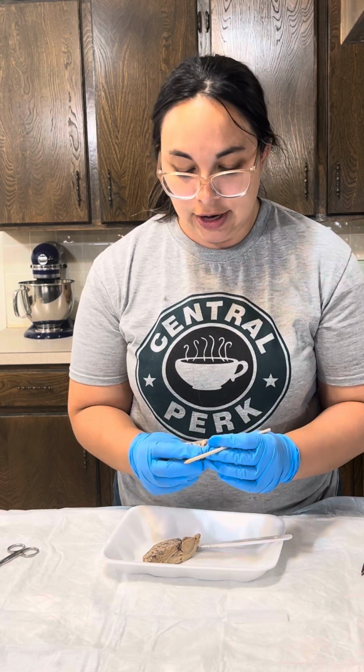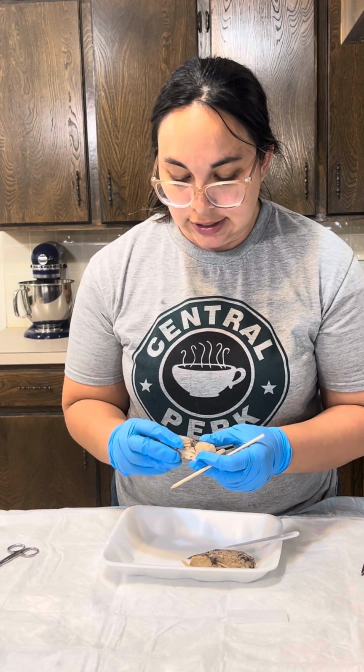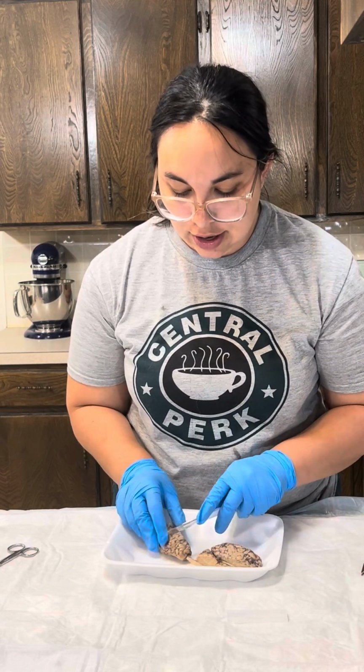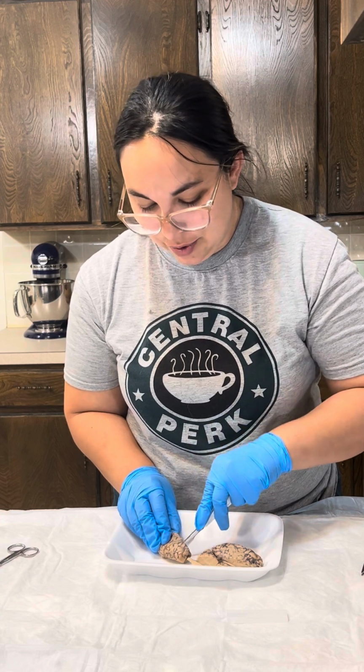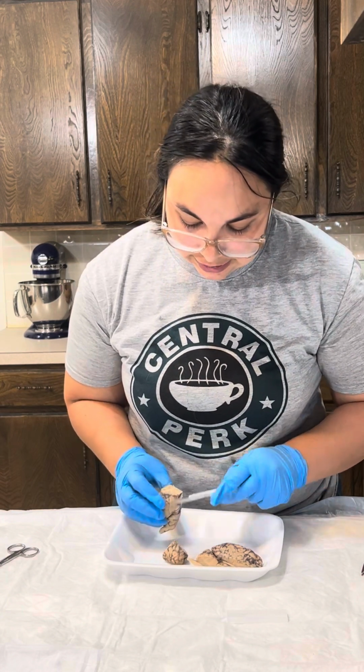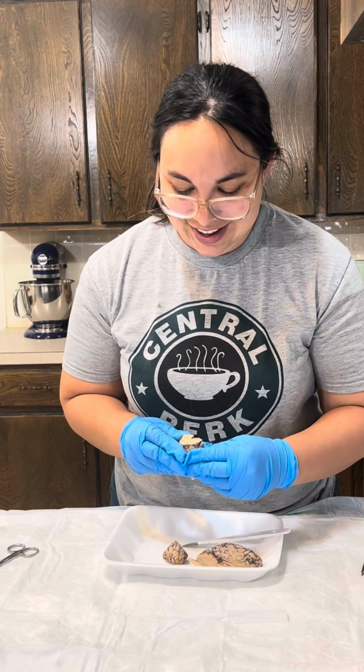So that's that part. There are parts here, if you notice, let's see, we're going to cut one of these open a little bit more. You're okay, it's good. All right, let me make sure I got everything that I need to talk about for that part. Okay, we're going to cut a piece. I'll tell you when I'm done. All right, so this is the next piece here. I'm done. Oh, I'm sorry. I'm done.